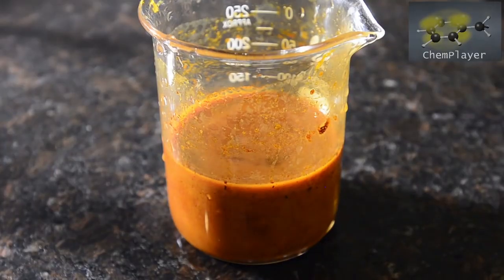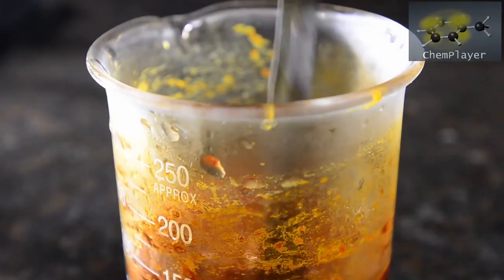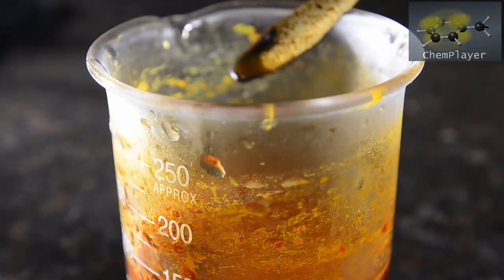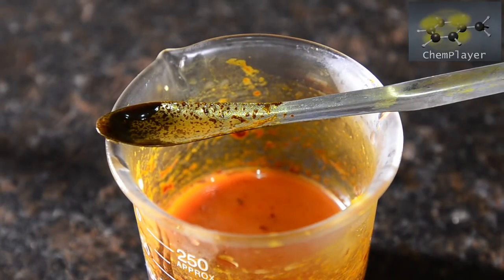We mixed the bright red filtrate we obtained with some cold water in a beaker to see if we could get any more precipitate. The result was an orange cloudy mixture with some brown goo which sank to the bottom. We don't know what this is, but it doesn't resemble our product, so we discarded all of this.